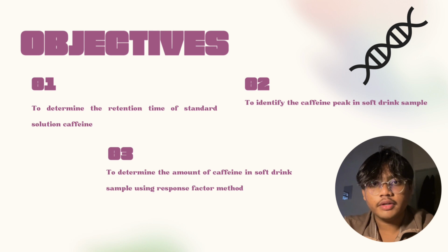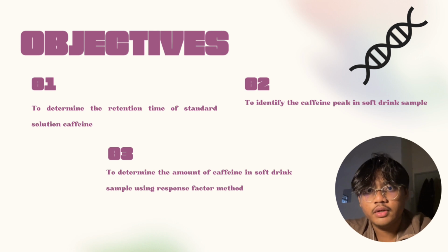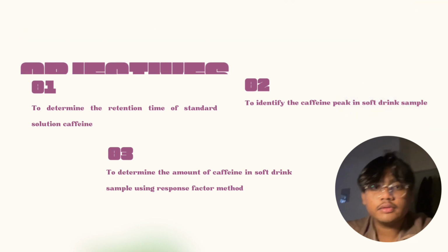For this experiment, there are three objectives. The first one is to determine the retention time of standard solution caffeine. The second one is to identify the caffeine peak in a soft drink sample. And the last one is to determine the amount of caffeine in the soft drink sample using the response factor method.